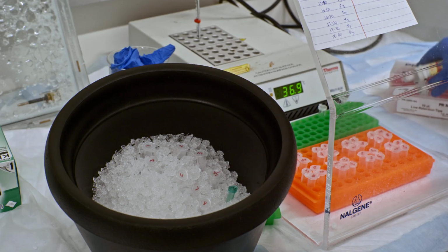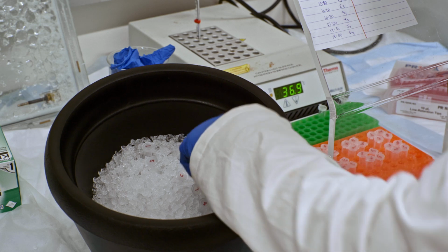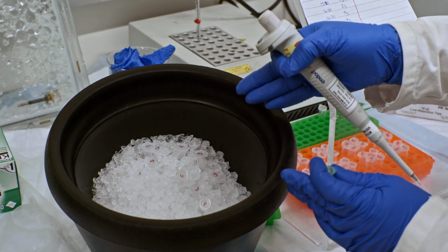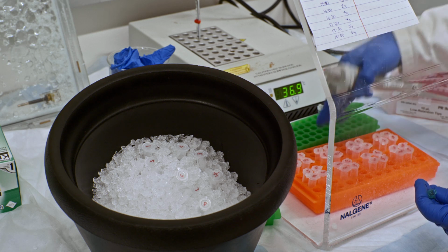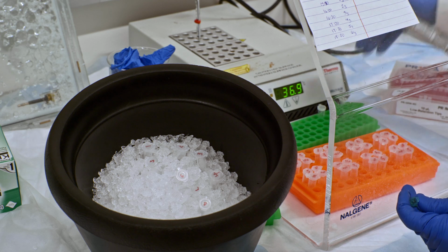What we first want to do to these reaction vessels is add the polymerase. We will want to keep these reaction vessels on ice until you add polymerase to each one of them. Once we do, we're going to transfer these polymerases over here behind our blocking screen onto where our set of samples will be collected, as well as where the radiolabeled DNA primer template strands are.